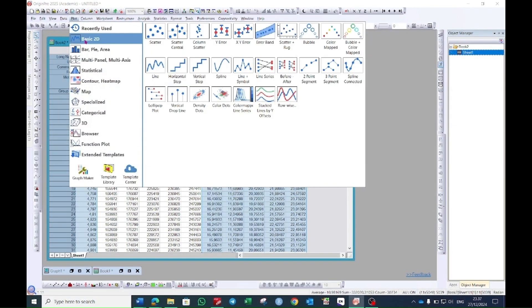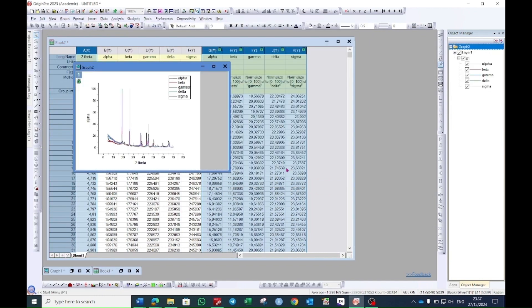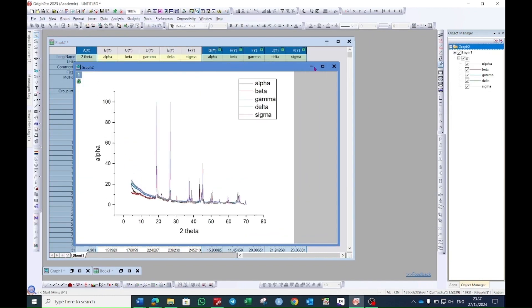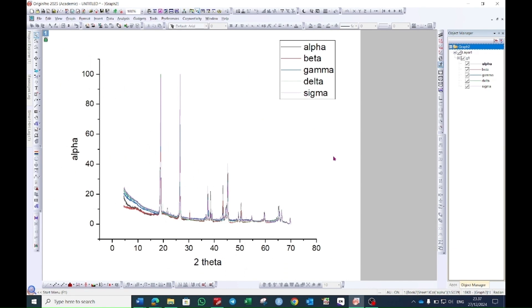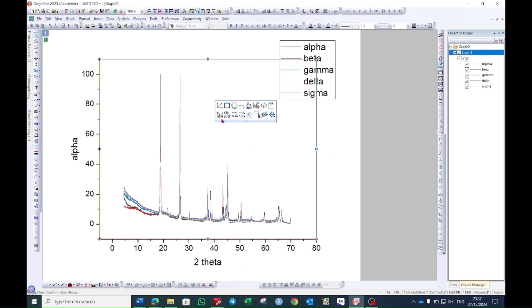You can choose the line plot from here, or you can go to the Plot option and then go to the 2D option. Here you will see 'Line' — click on this one and it will open a graph window.